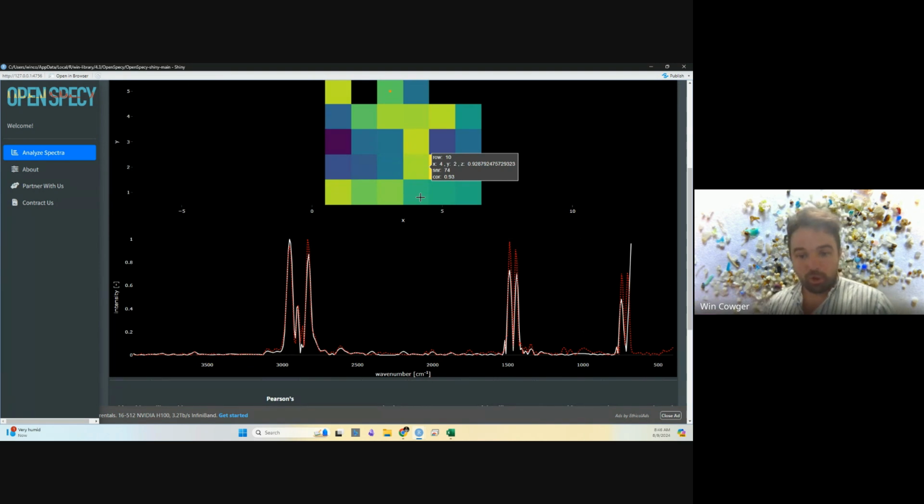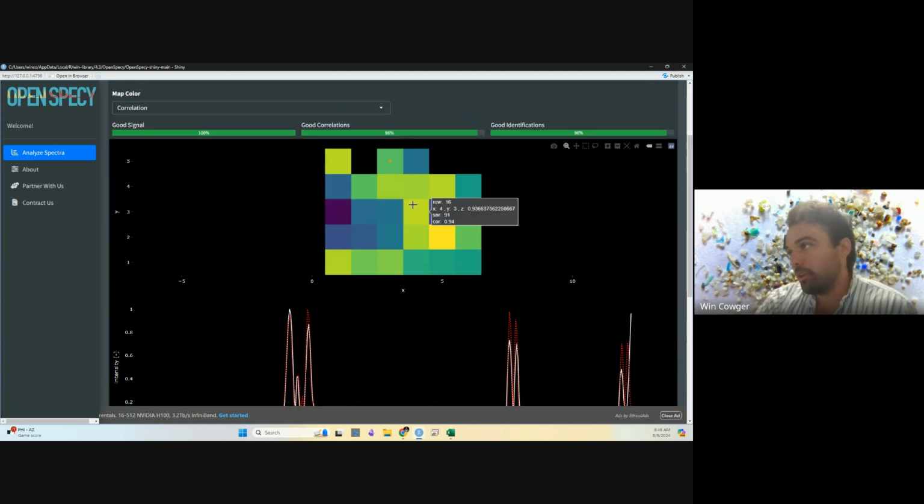So there are different approaches that you could take, and I recommend you set up your plan for how you're going to batch analyze your spectra and just stick to that plan, write it up in your research methods, and be very consistent about how you're processing the spectra. Make sure not to bias towards certain classes of material types.